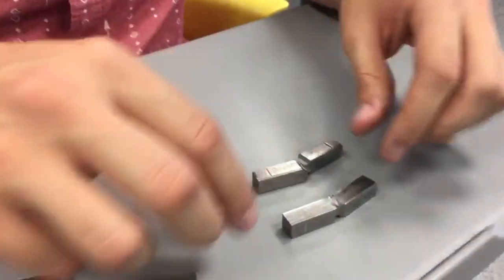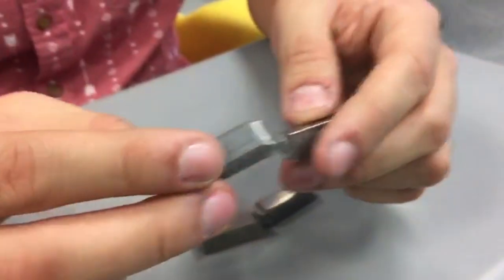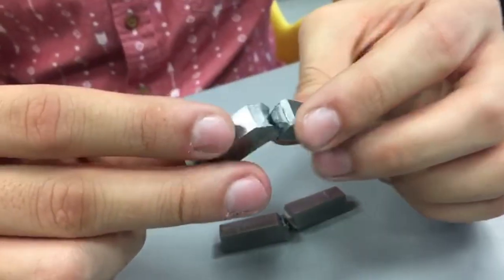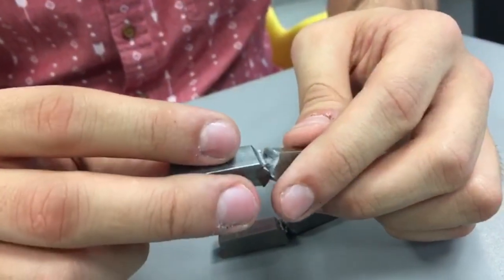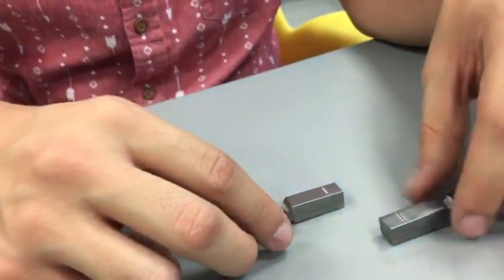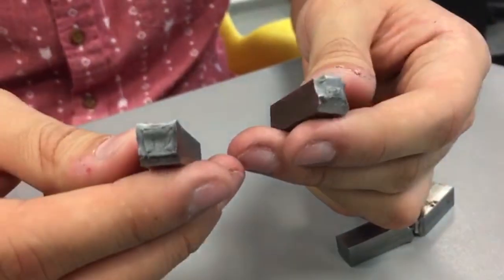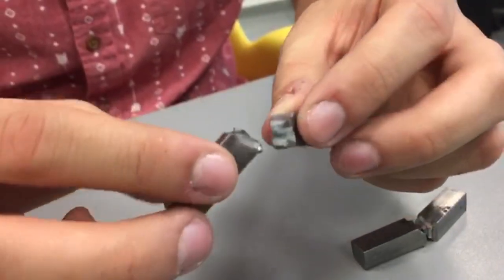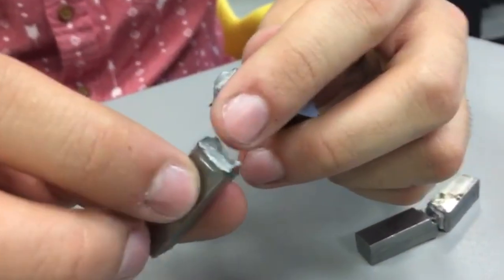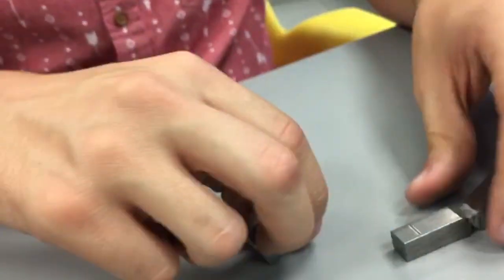For the steel 1018, we have little tips here, so we can say that it's more ductile, and it needs more energy to break the piece. If we compare this one that was at 25 Celsius degrees, we can see that it didn't take that much energy as this one.